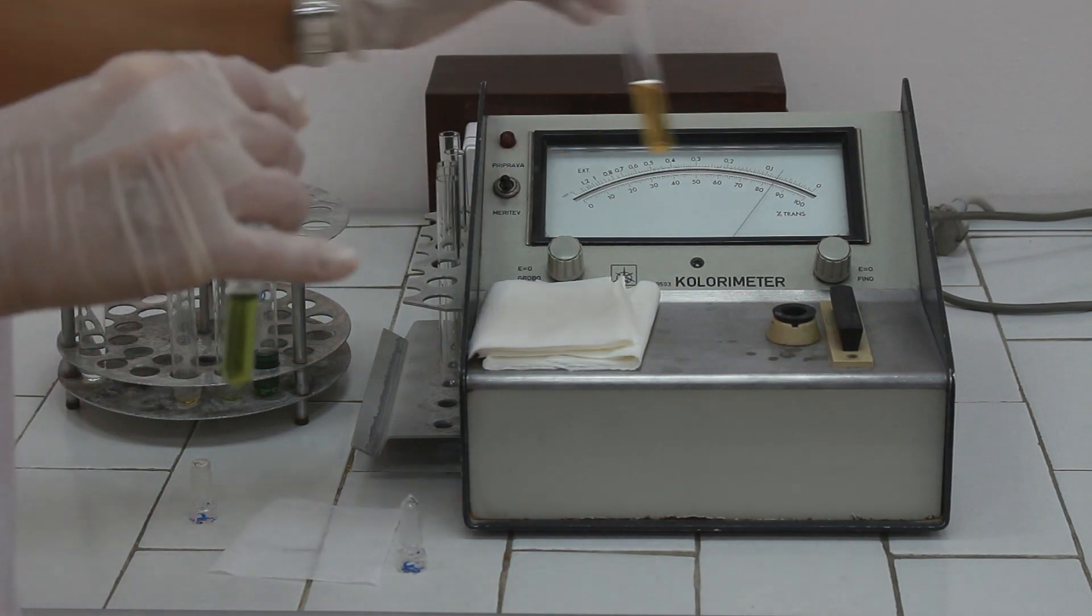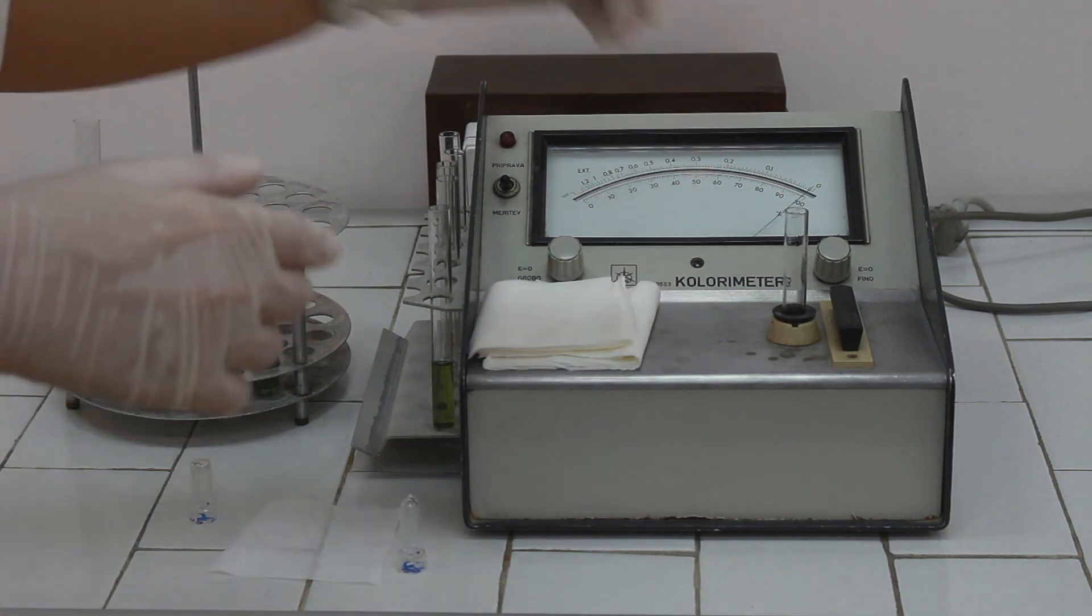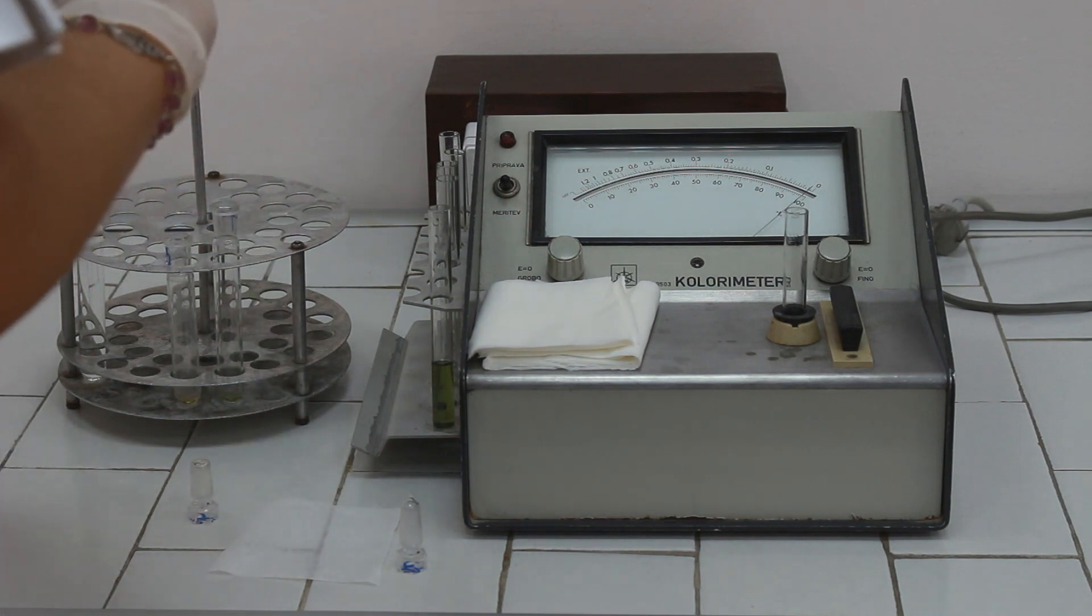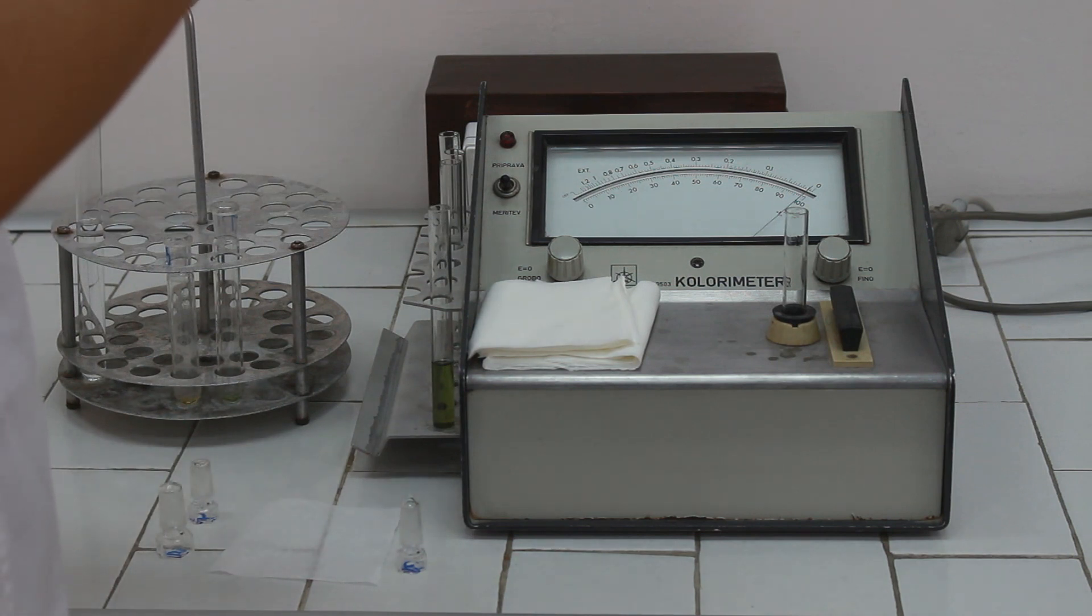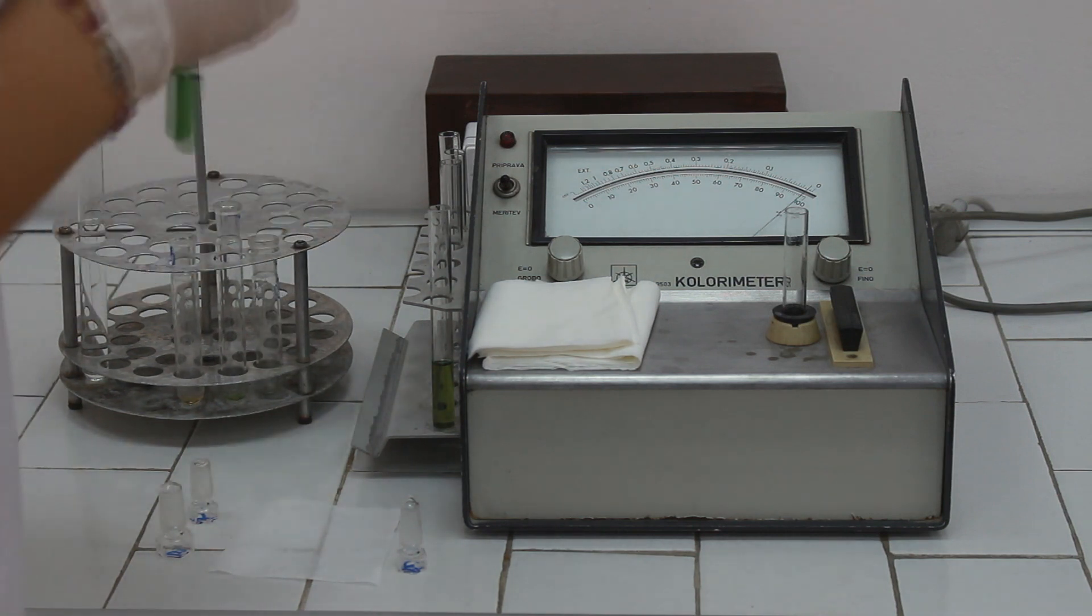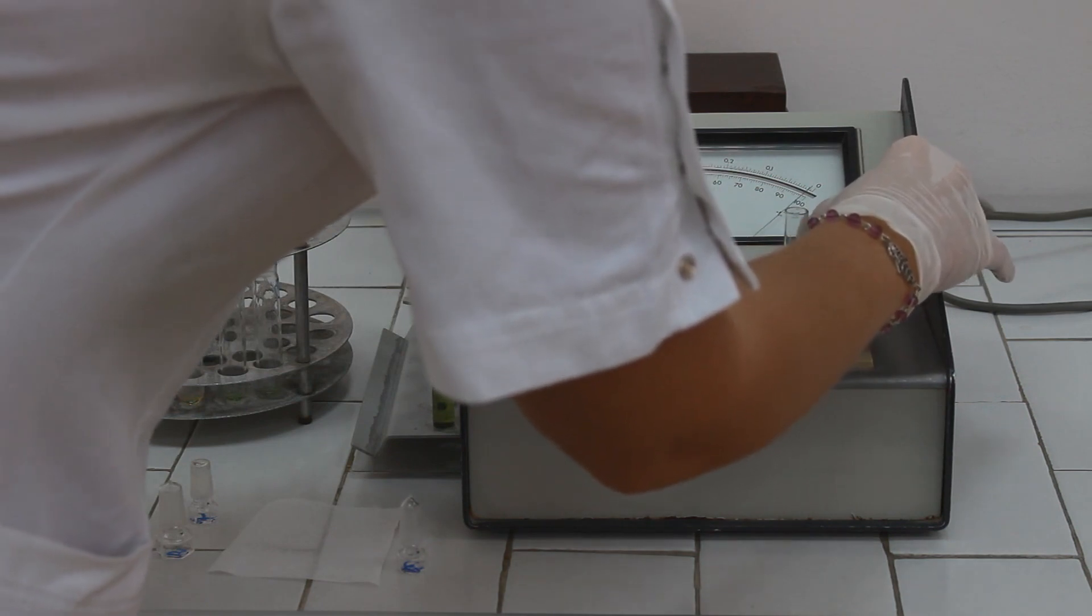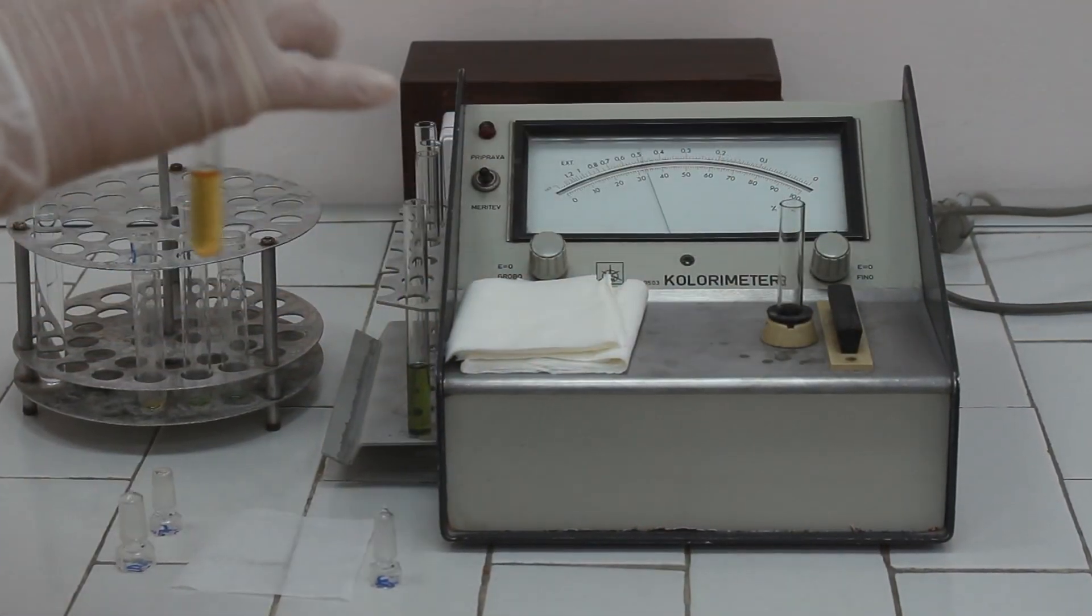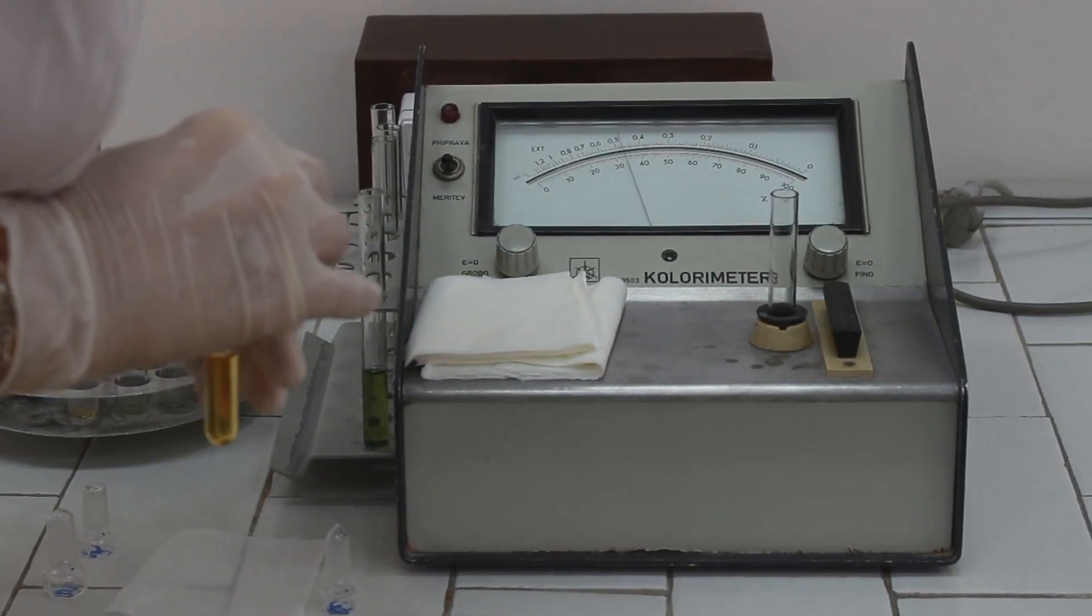Take out the test cuvette and put back the blank cuvette. If the zero of instrument is changed, adjust it again. Then, take the standard solution and pour it to another cuvette. Take out the blank and put the standard solution. Read the absorbance. The absorbance in this case is 0.48.